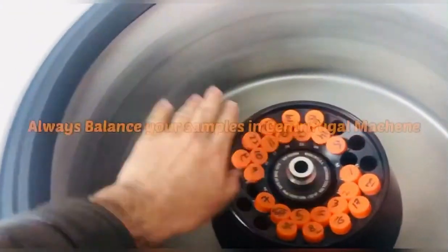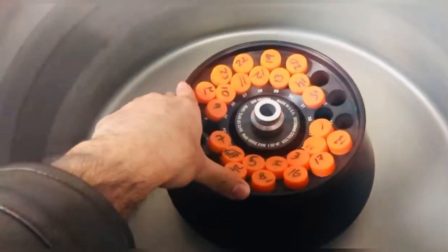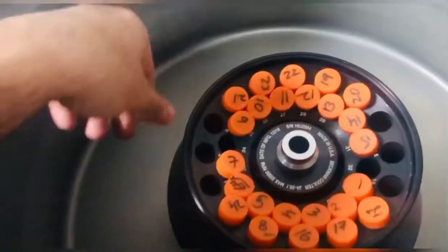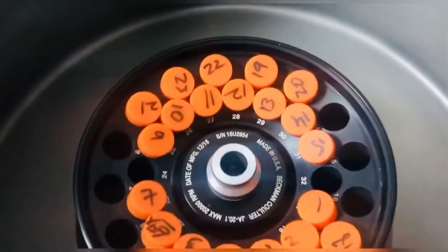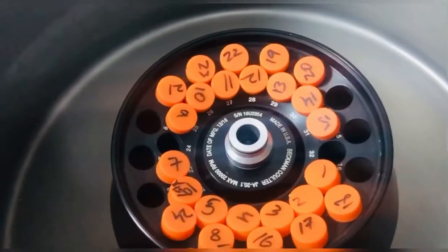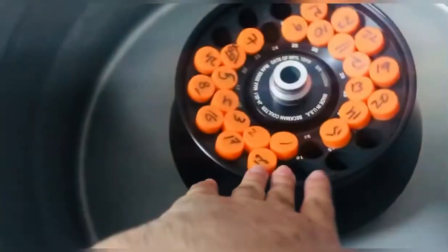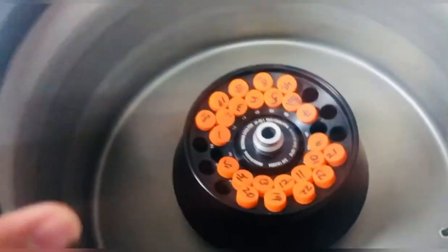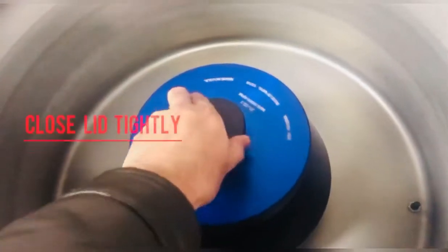The temperature is very cold — I have reached 4 degrees centigrade. You can have up to 32 samples at the same time in this machine. Very huge. You can save a lot of time using this centrifugal machine. And close the lid.